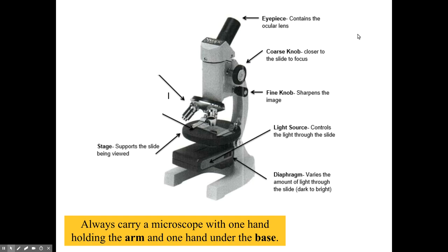Our microscope stage is round and it's where the microscope slide sits. The stage clips keep the slide in place when you're viewing. The objective lenses—we have three: a red one, a yellow one, and a blue one. They rotate so you can get closer to the image.